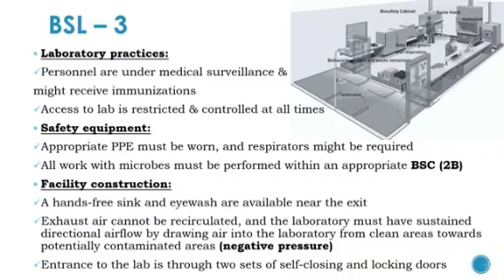Laboratory practices. The personnel working in the laboratory are under medical surveillance and might receive immunizations. Access to the laboratory is restricted and controlled at all times. Safety equipment. Appropriate PPE like solid front gowns must be worn and respirators might be required. All work with microbes must be performed within an appropriate biosafety cabinet of Class 2B.